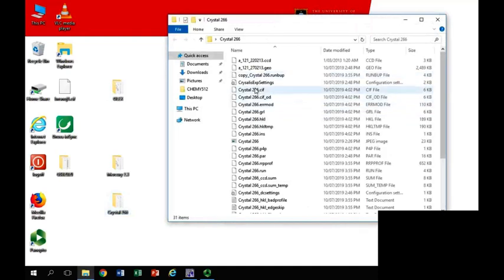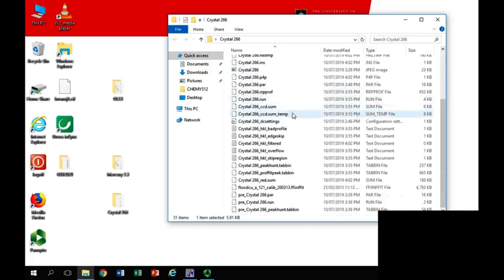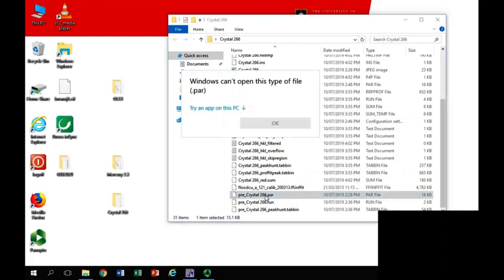To start with, I will give you a sheet, and I will give you all the files. Only 4 of them could be opened in OLEX 2, but here's a whole lot of them. And I will ask you to find some data in those files. And you may have to look through a number of files to find those. Oh dear. It doesn't know what it's doing.